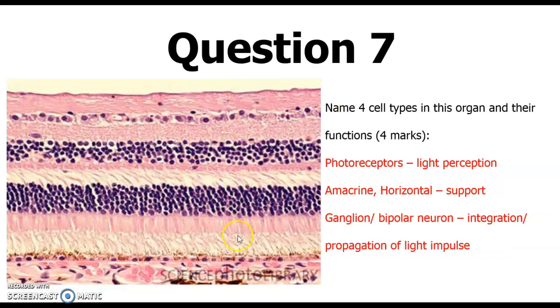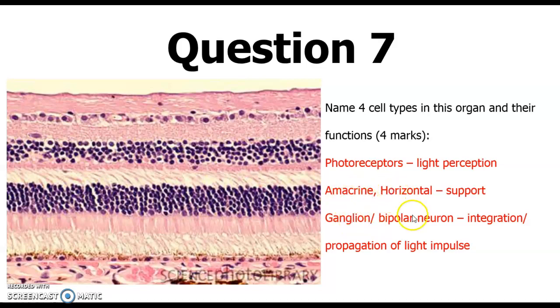This is a slide of the retina, so you can see all 10 layers and appreciate the various cell types. Remember these cell types support the photoreceptors, support the ganglion cells, and the amacrine cells are for the bipolar neurons. The photoreceptor cells include the rods and the cones.